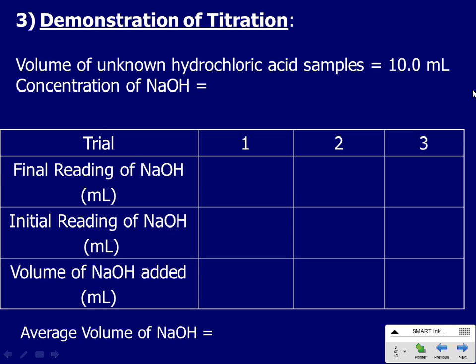Okay. We're going to be doing the titrations in this room, and that's because we don't need Bunsen burners or anything like that. So we'll have the equipment set out there. What I'm going to ask you to do when you grab your equipment is grab 3 100 milliliter beakers and probably 1 400 milliliter beaker, and I'll explain why you need all these.